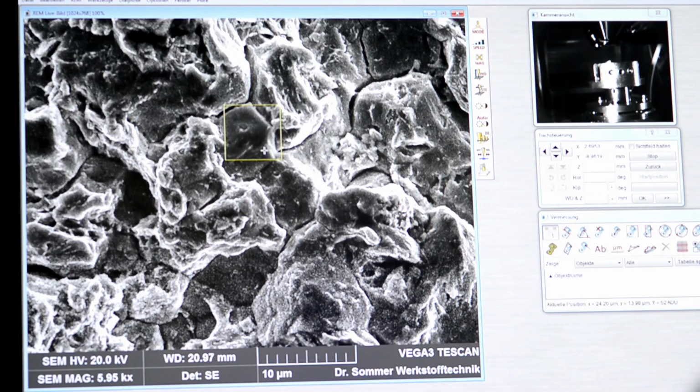In the end, we were able to reliably detect the hydrogen-induced brittle fracture. The nature of the break was quite typical, as well as the hardness. So I think both companies learned something here, namely to stock and supply hydrogen-free screws in the future.